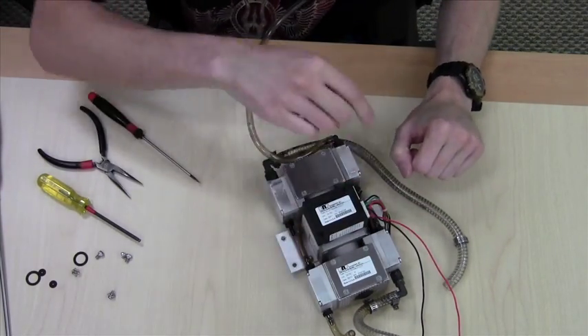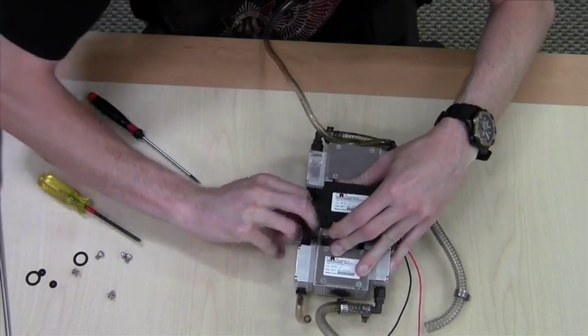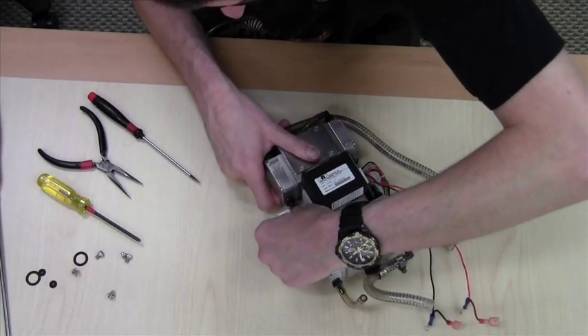Simply repeat for all four corners. I recommend doing only one corner at a time so you can keep track of what you've replaced. The tip simply slides back on.